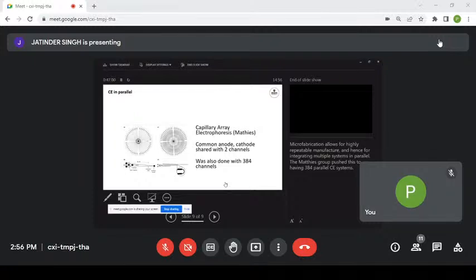And one of the nice things is that these high throughput devices are one of the reasons that the Human Genome Project finished in time. So they could use the electrophoresis, but they could go a lot faster, having highly parallel, and then the Human Genome Project got finished. So that's nice.